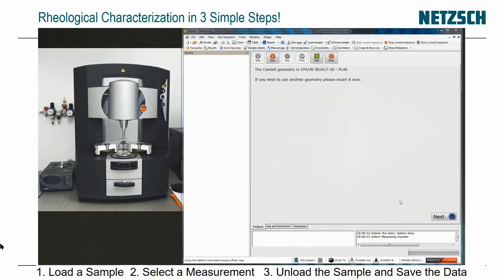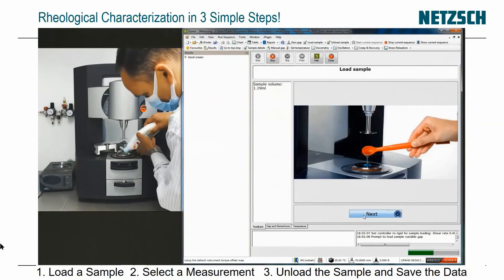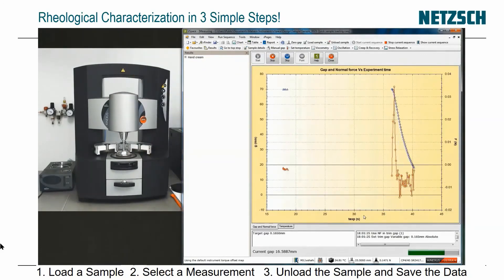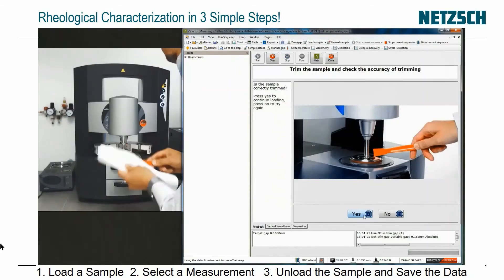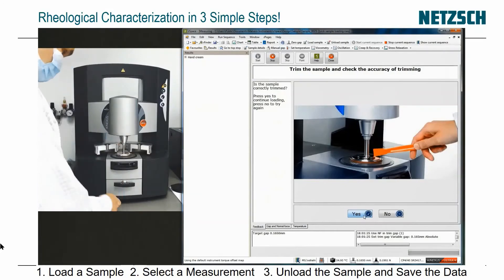I'm going to click Load Sample. The software sees it's got a four-degree 40 cone. I type in the sample name — hand cream, specifically Juergens hand cream — and click Next. It's asking me to open the hood. It tells me to put on 1.19 mils, then click Next. I'm trimming off the excess sample with a spatula. Obviously if you put the right volume on you don't need to do this.